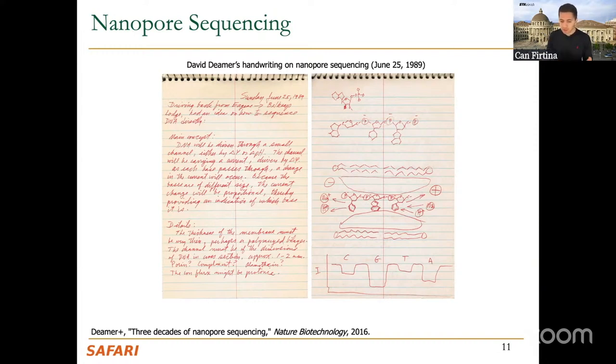And again, this is the question that David Deamer and his colleagues were asking, and this is basically what he imagined. But essentially, there were limitations to it. The idea works on paper, perhaps theoretically, but it didn't work in a practical manner. The question, can we move the DNA, was yes, we can move it. But at what speed? Earlier, the scientists figured out that this DNA moves at a very high and also very non-controllable speed.